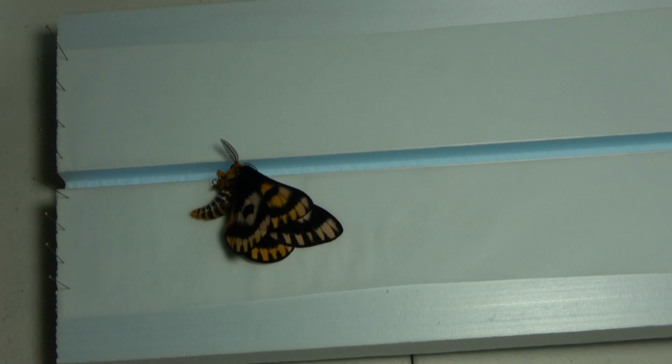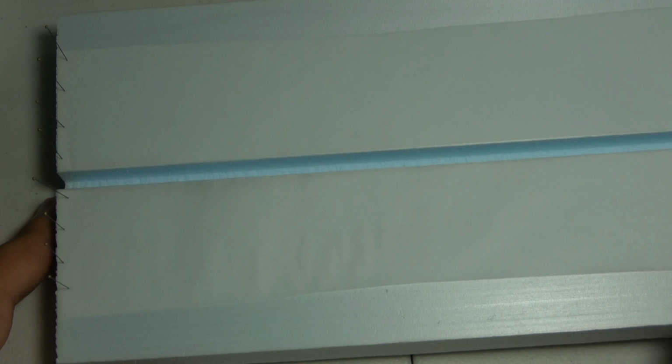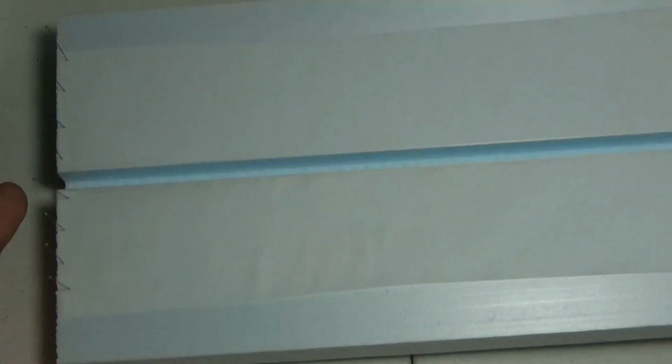Before we get to that, you need something to hold the wings. So what I use here is tracing paper. I cut strips of it and then put it along the groove in the center there, and I hold it down with pins, as you can see right there.